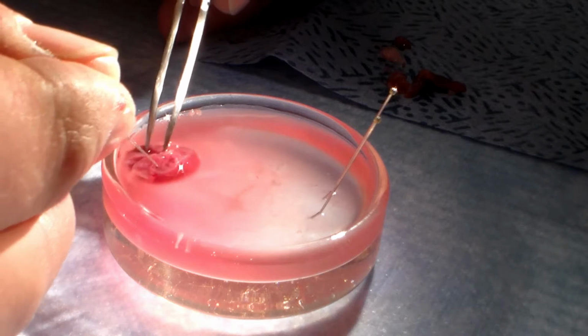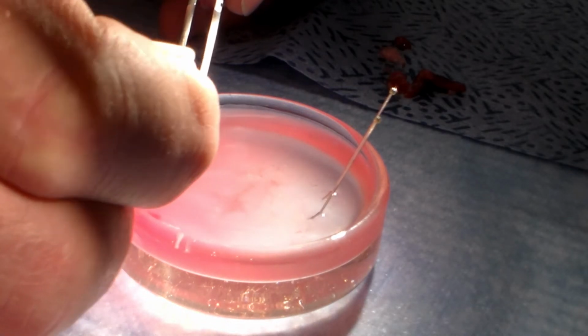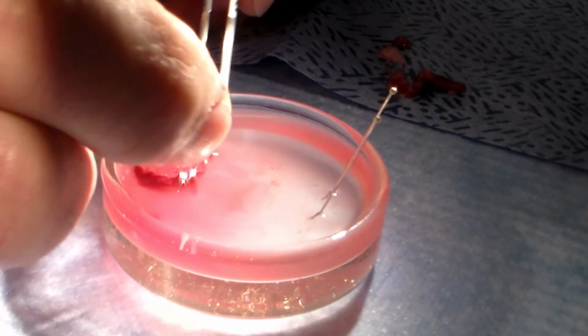The technician now pins down the walls with the epicardium down to then expose the endocardium.